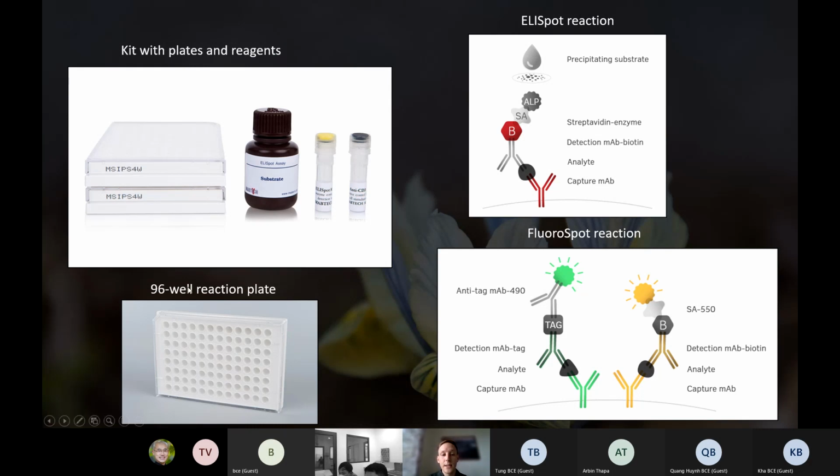The scientists or researchers want to buy these plates where you have the 96 wells. And at the bottom of these wells, you have something called a functional membrane. This is the membrane that we see over here. That is the membrane at the bottom.